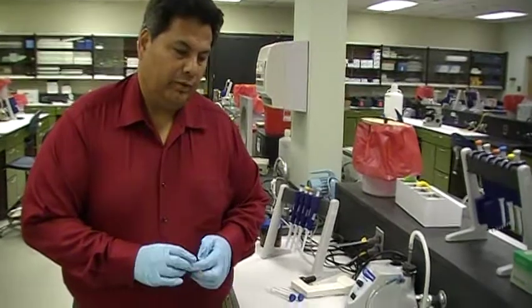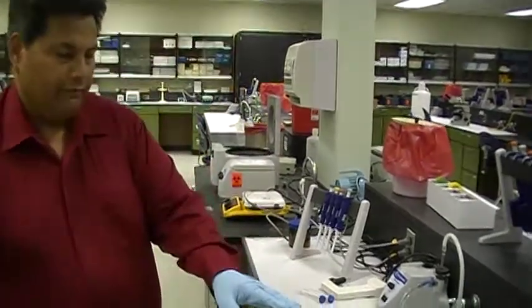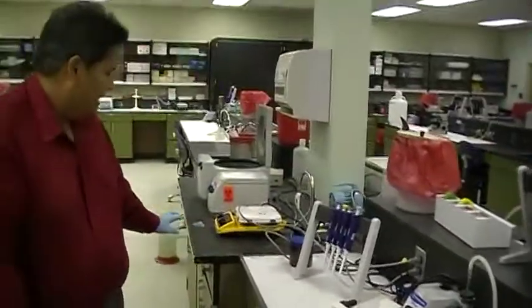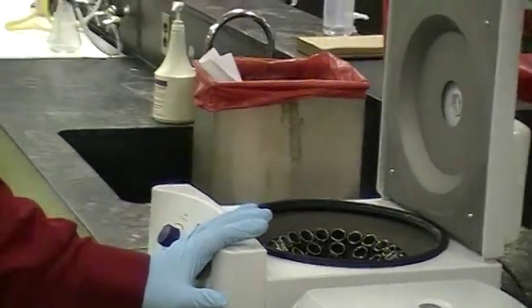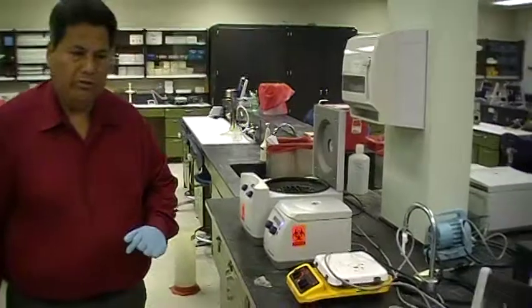This morning, I'm going to show you how to use three centrifuges that we have in the lab. We have a tabletop microcentrifuge, a larger tabletop microcentrifuge, and a clinical centrifuge. I'm going to go through each one of them and why we use them.